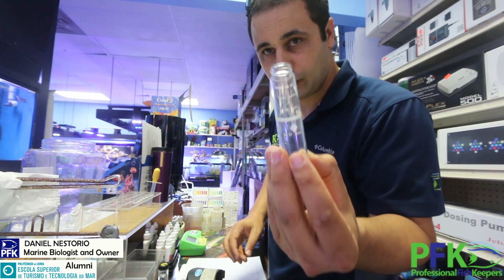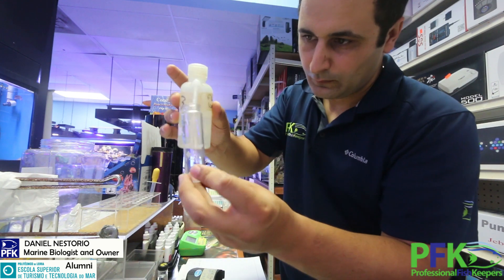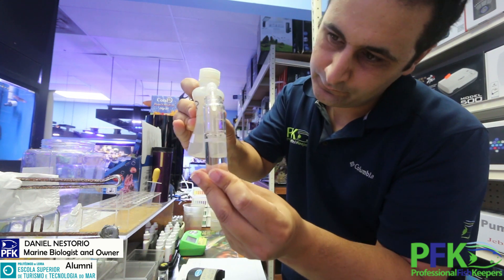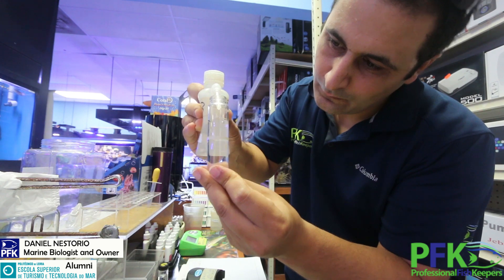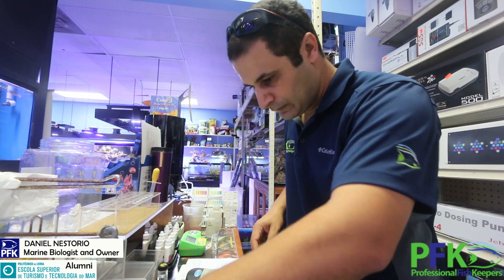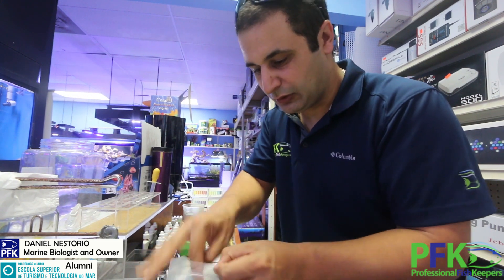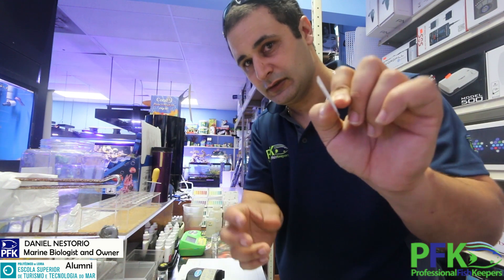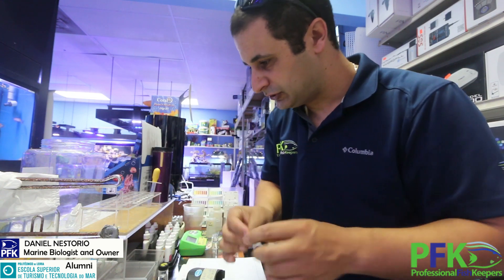Now fill up another tube all the way to 25 milliliters. If you have more than one system, just do them all, but always label the tubes. Then take one pouch of reagent and shake it in.